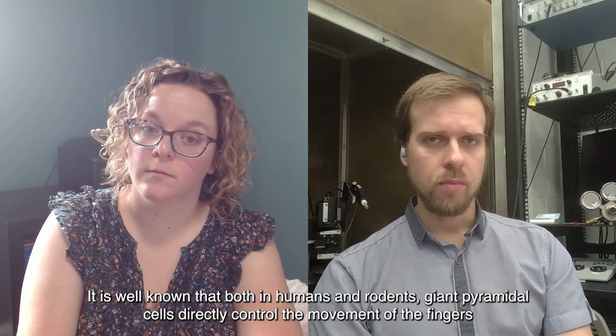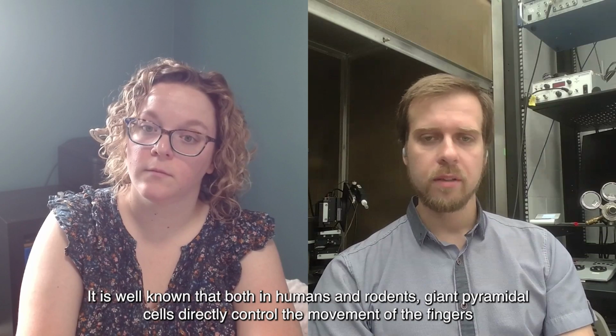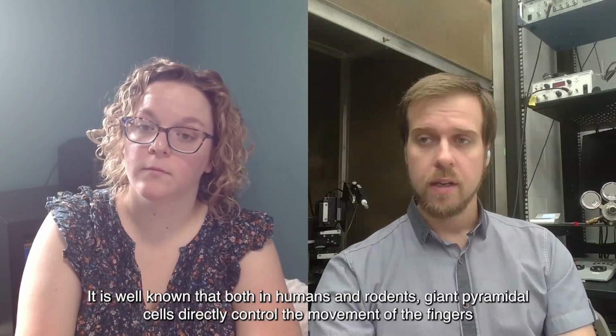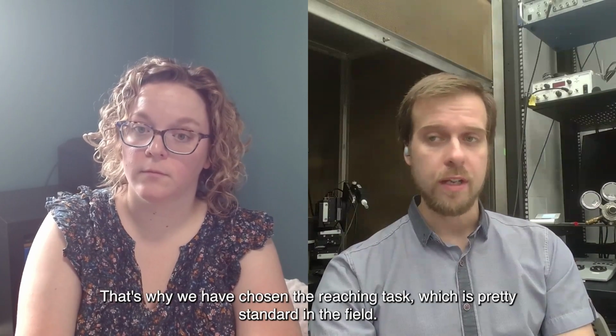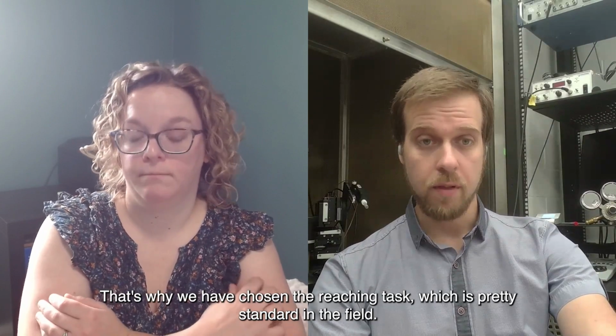It is well known that both in humans and rodents, giant pyramidal cells directly control the movement of the fingers and dexterous action like reaching. That's why we have chosen the reaching task, which is pretty standard in the field.